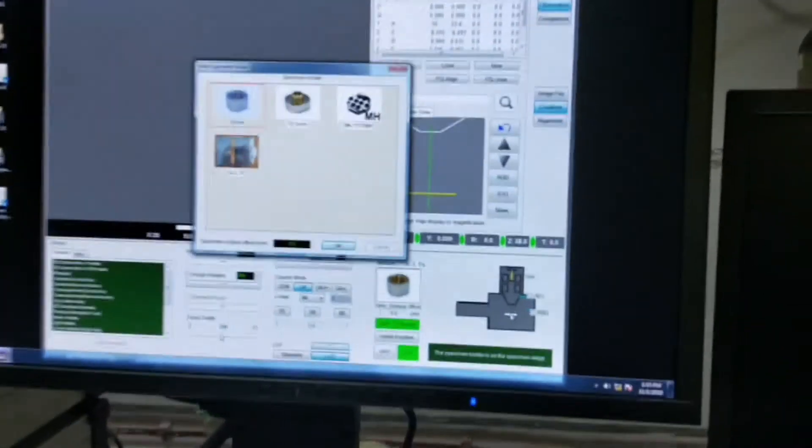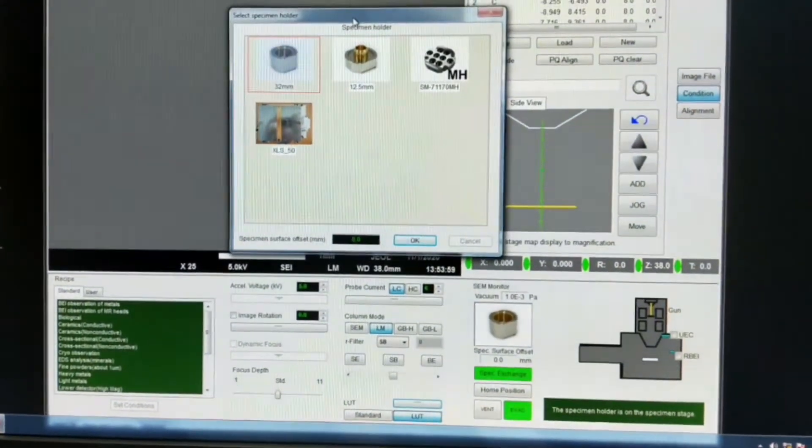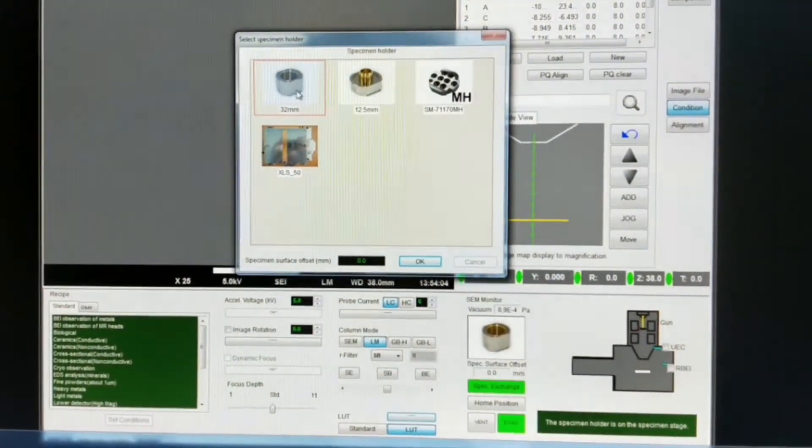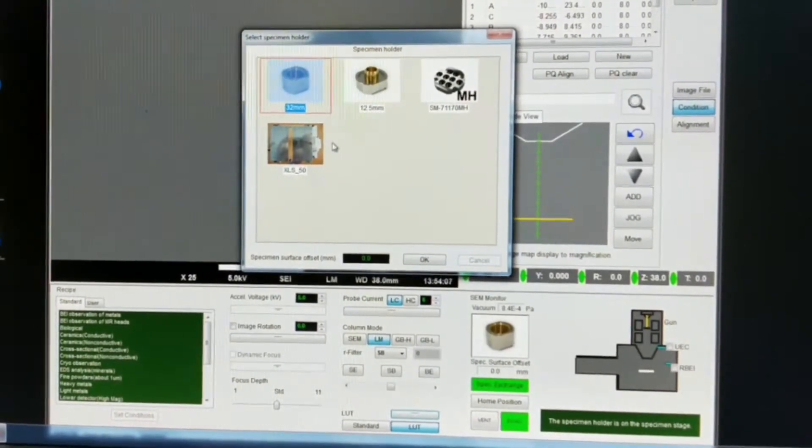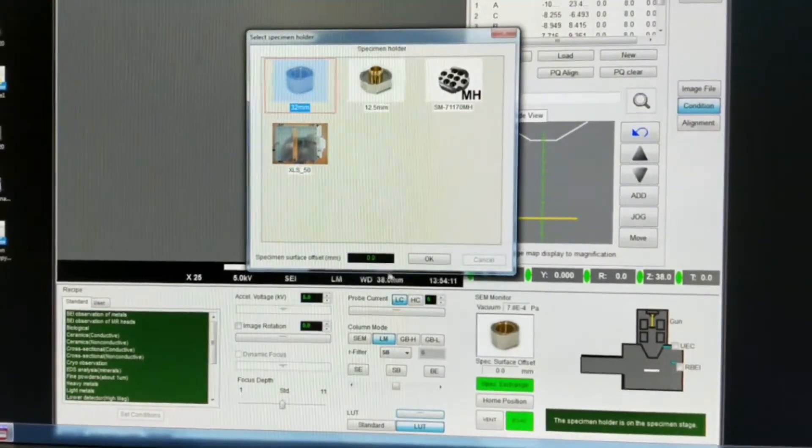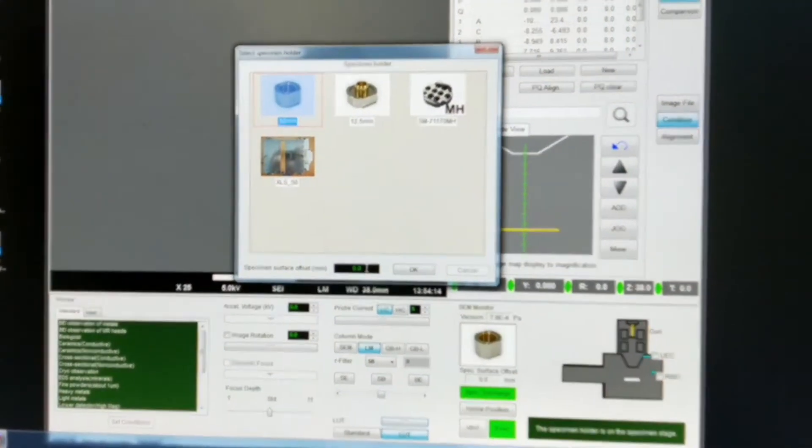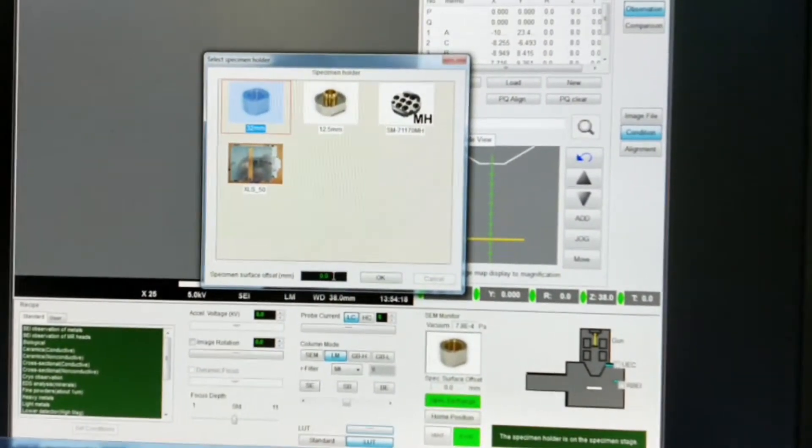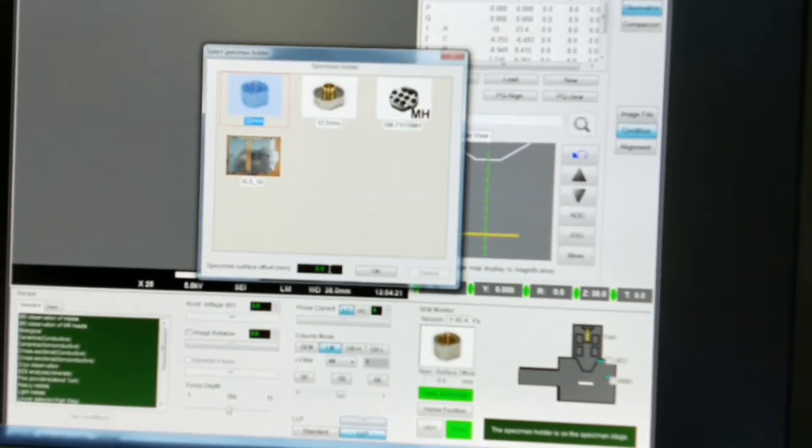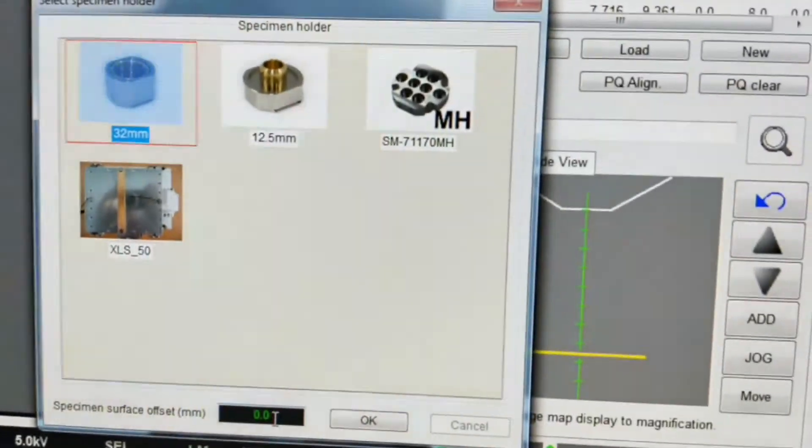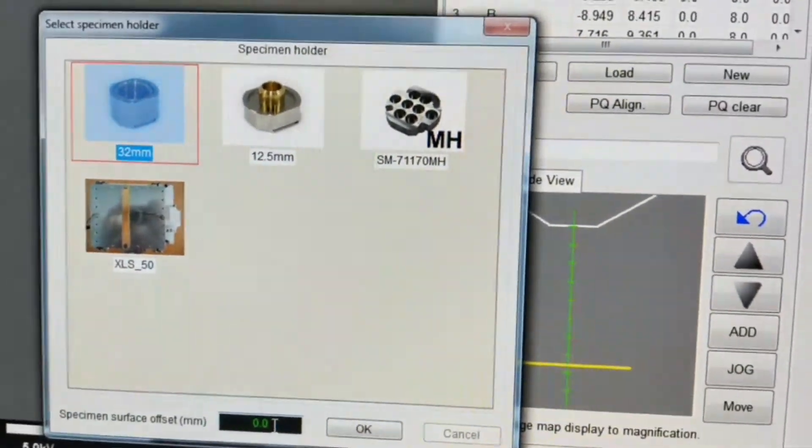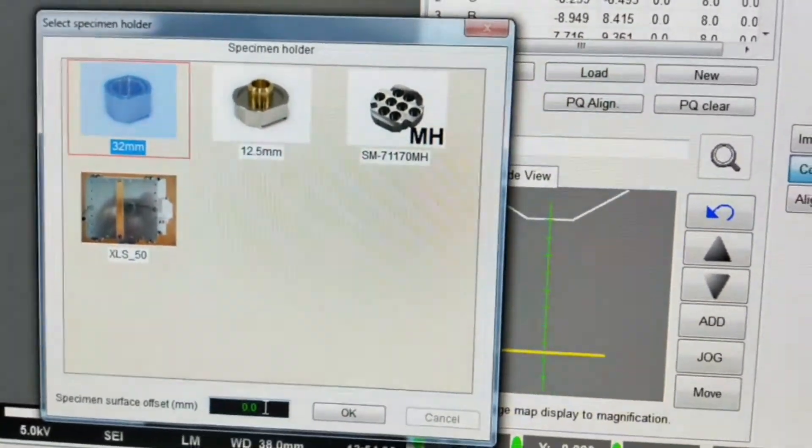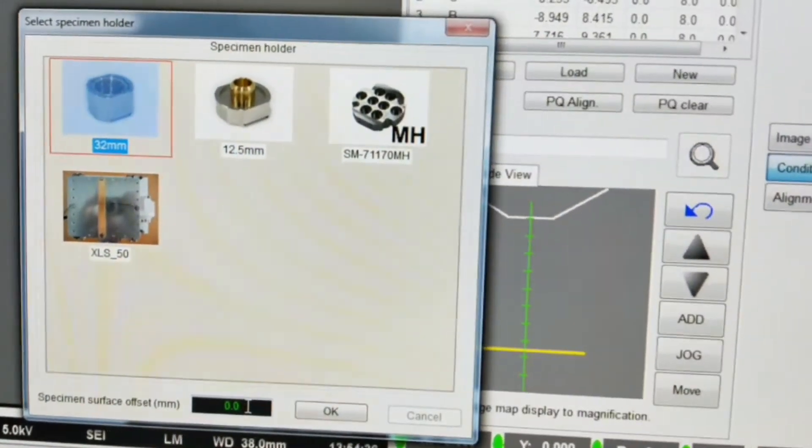Once the sample is inserted, we can see this dialog box where it is asking the specimen holder that we are using. So we can select it. We have to give the offset, and the offset means the thickness of the sample. In this case we are using the butterfly wings, which has much less thickness, so we don't require to give any thickness parameter. But if we are using glass slide or any thick material, then in that case we have to give the thickness of the sample.